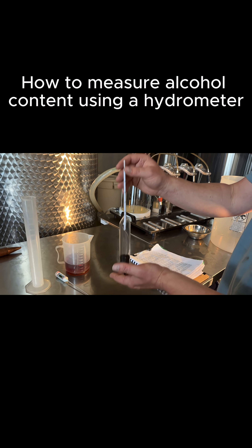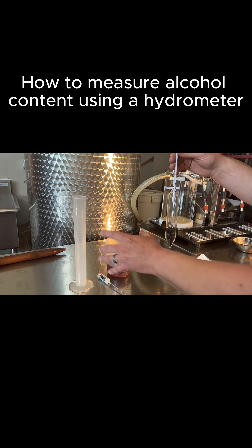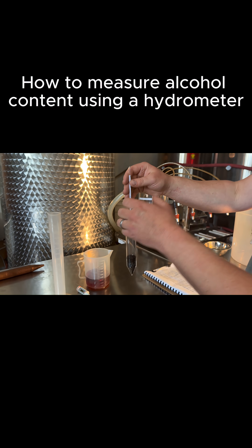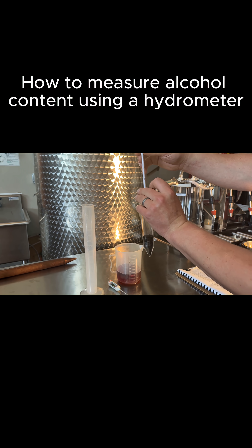This is our hydrometer, and they work based on essentially buoyancy. The more dense your liquid is, the less far the hydrometer is going to fall. Ethanol is actually less dense than water, so the more ethanol that's in it, the less dense the solution is going to be and the higher it'll rise in the water itself.